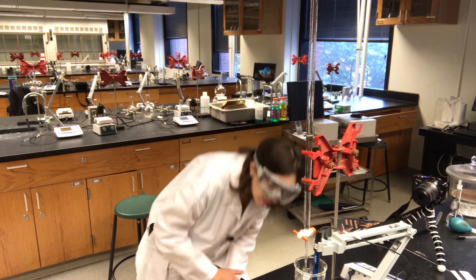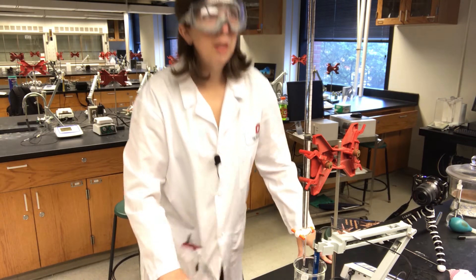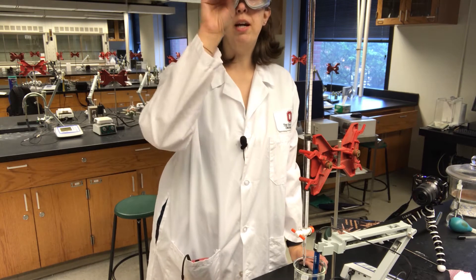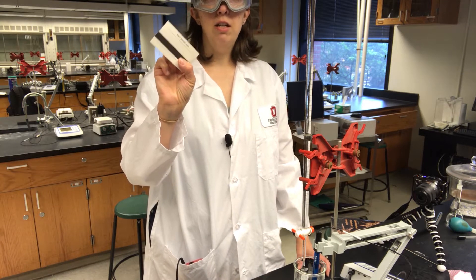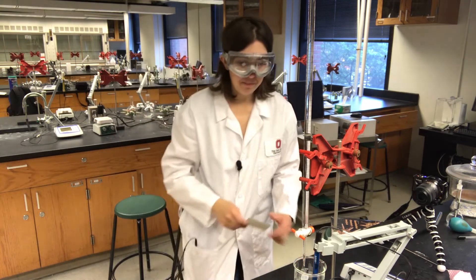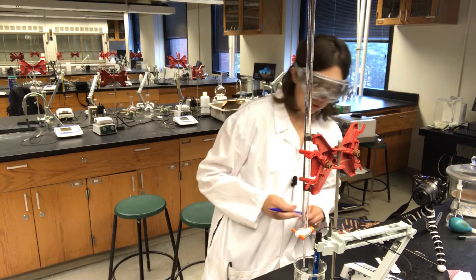I've set up my pH electrode on an arm attached to the pH meter itself, and I've made sure that the glass bulb is completely submerged in the tartaric acid. I'm sitting on a stool because my setup is pretty tall — I want my eyes level with the meniscus in the burette. Using my burette reading card, my initial volume reading is 4.95 mL.